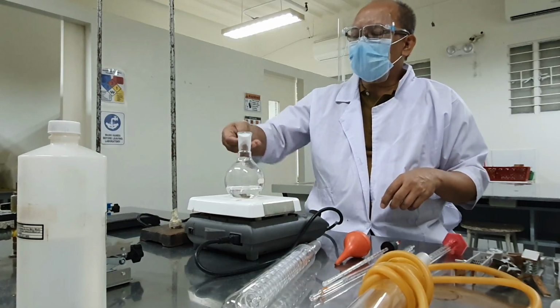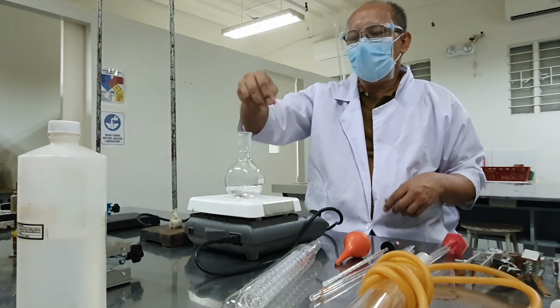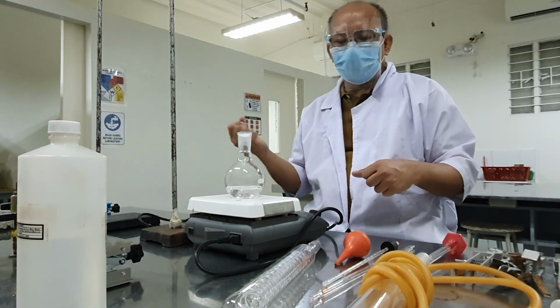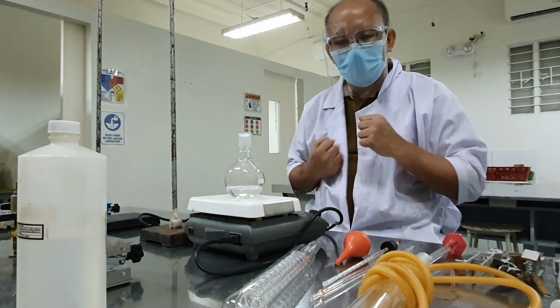If you add these porous stones, they will generate tiny bubbles, so the distillation will become smoother. You can add 4 to 5 pieces of that. That's enough.